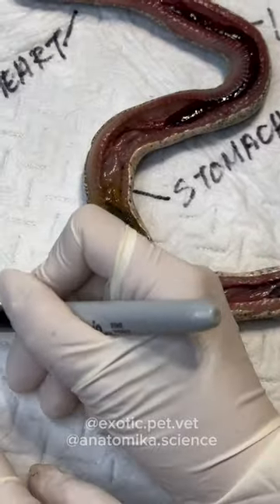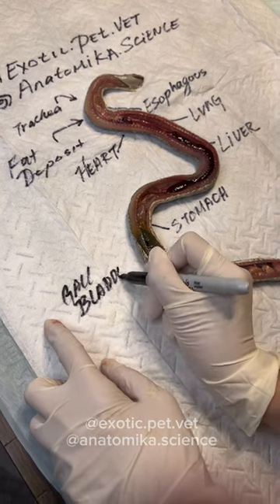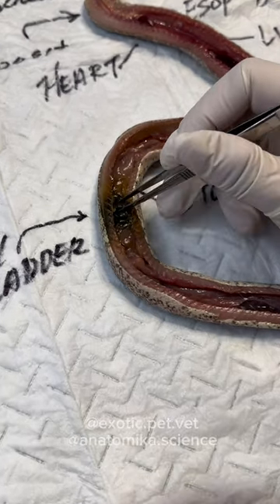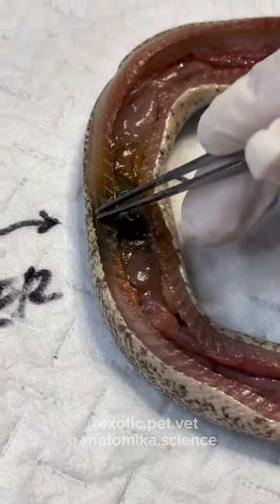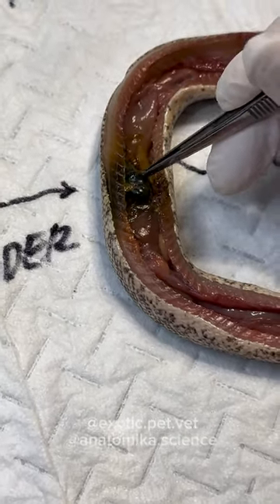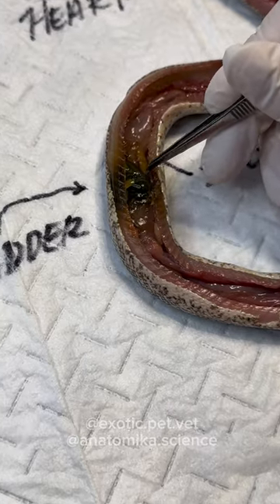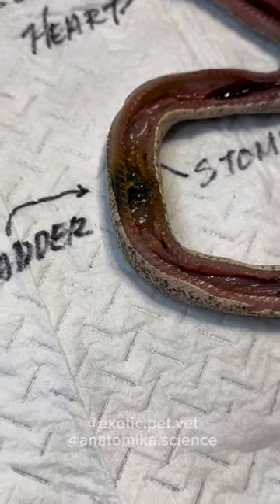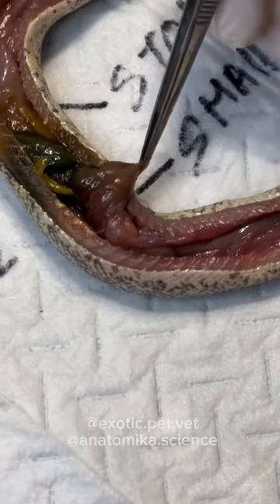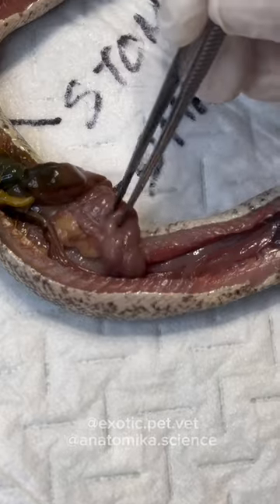We have the gallbladder right here and it's green. The bile has actually stained the flesh around the gallbladder itself — this is a topological effect of death. It has nothing to do with disease or why she died. The small intestine is right here — it loops back and forth. You can see the loops.